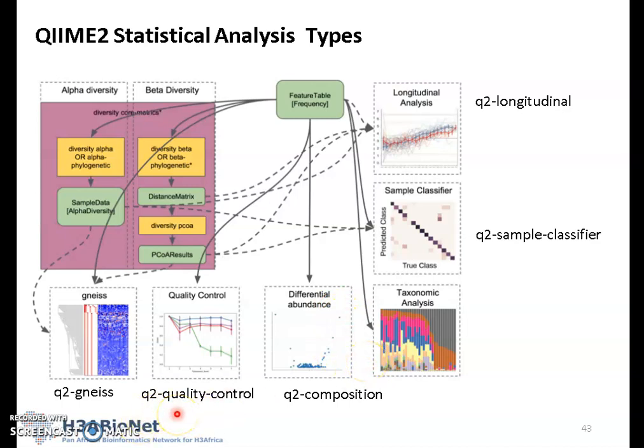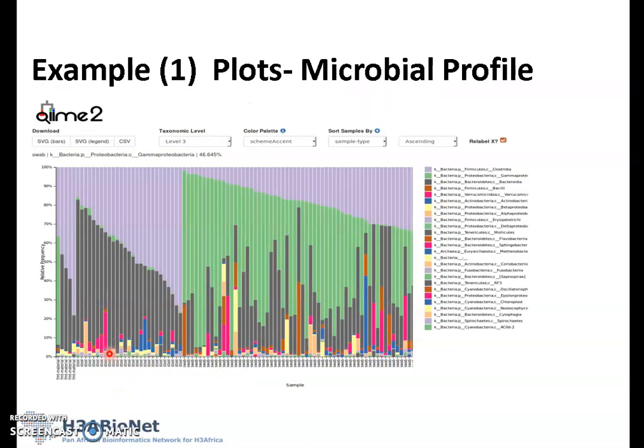You can do a quality control check of your dataset. In this case, you might have a control sample of a specific research. Then you can run your other samples and compare them to those control ones to see how they compare to each other. You can also come up with a dendrogram or a heat map, which shows different patterns of the microbes depending on your dataset.